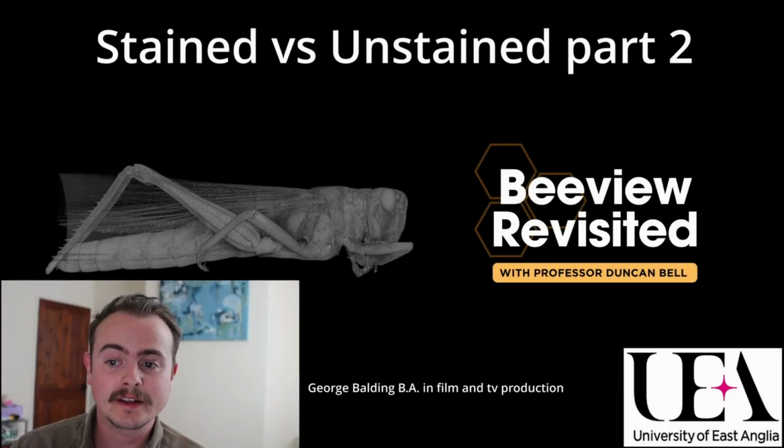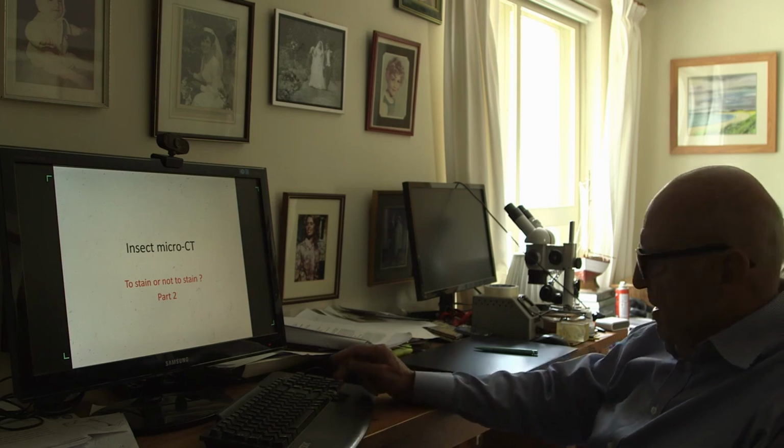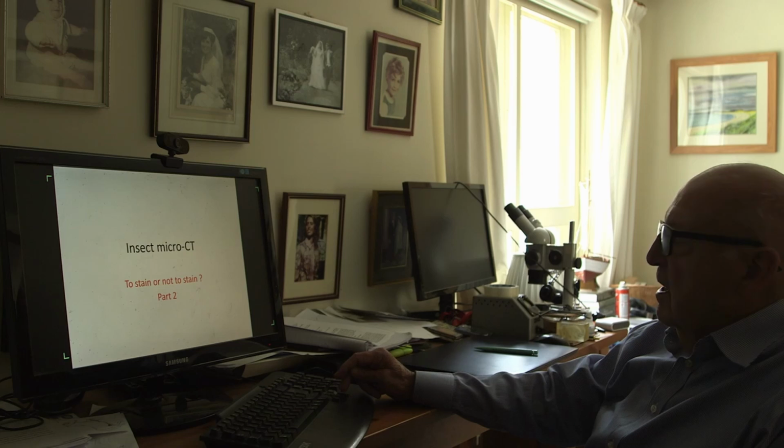In this video, we're tackling the debate over using stained versus unstained samples for micro-CT scanning. In part 1, Professor Duncan Bell will present the arguments in favour of staining, exploring how it enhances and contrasts detail in the scans. Then, in part 2, he'll switch perspectives to discuss the potential drawbacks and make the case for using unstained samples. This is the case for sometimes not staining insect specimens, at least in the first instance.